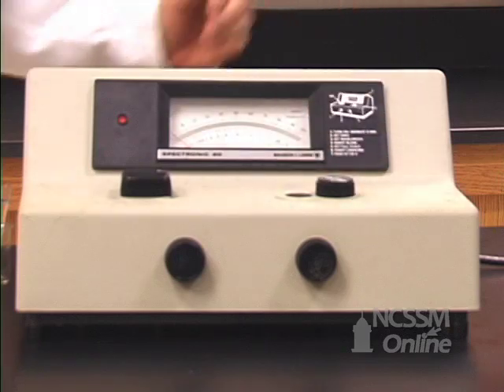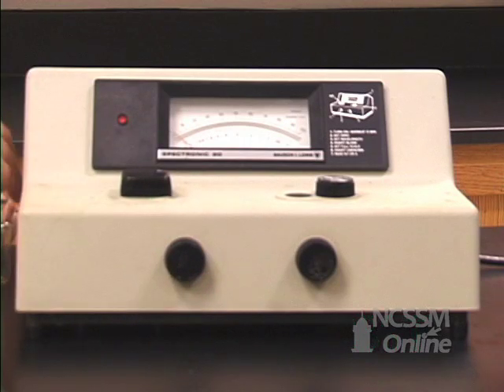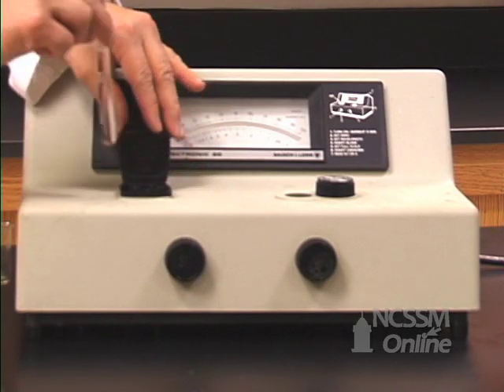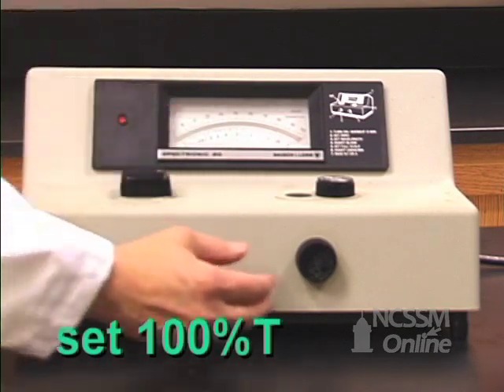We set the 0% T with nothing in the cell holder. Our blank contains 0.1 molar nitric acid. We set the 100% T with the nitric acid solution.